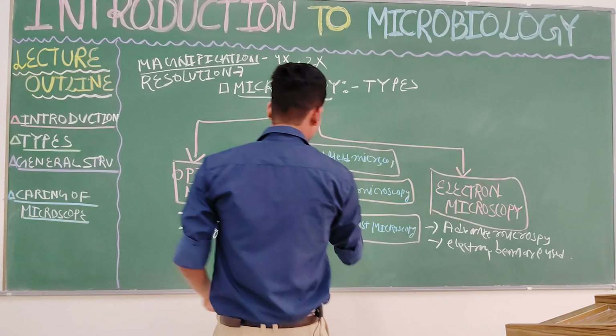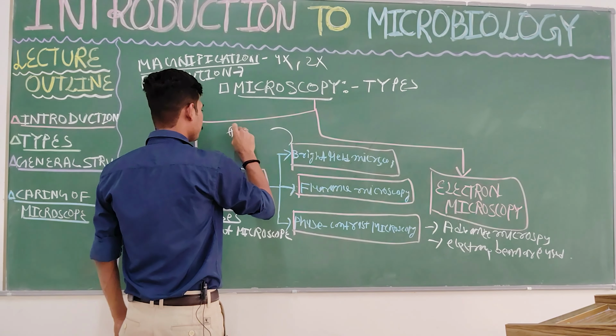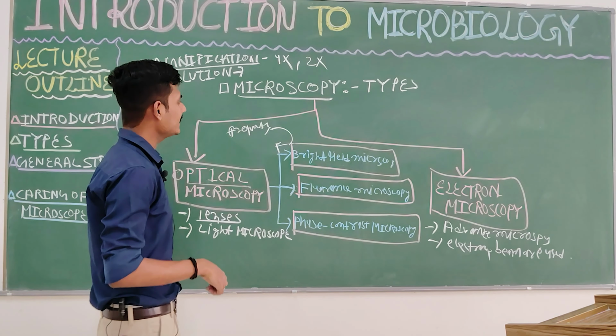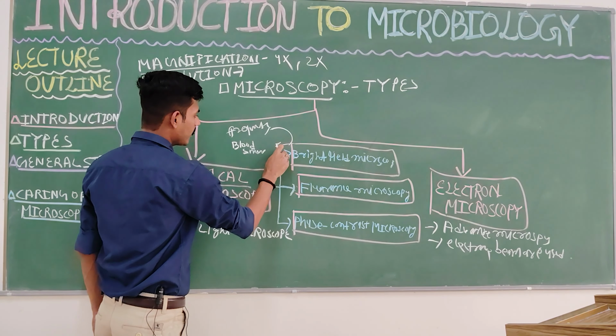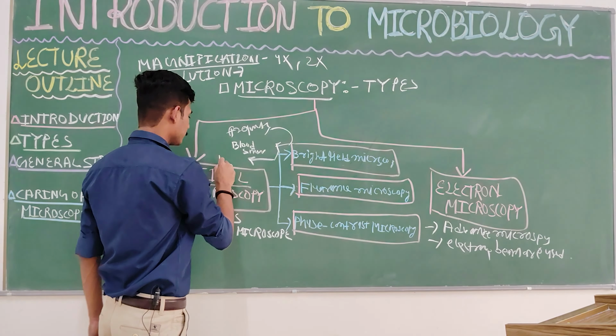It is a frequently used microscope in the laboratory setting. Second, it studies the blood smear, and it is also used in the study of tissue structure.